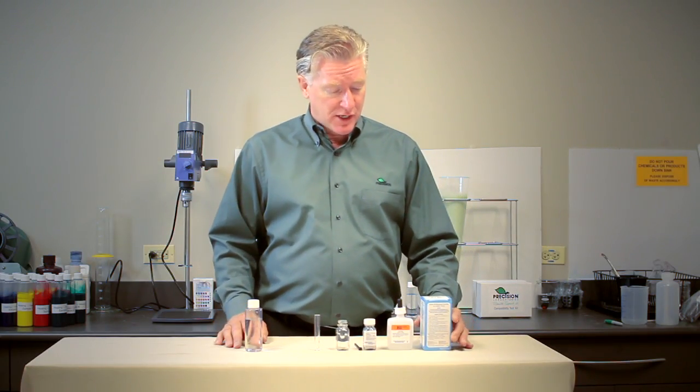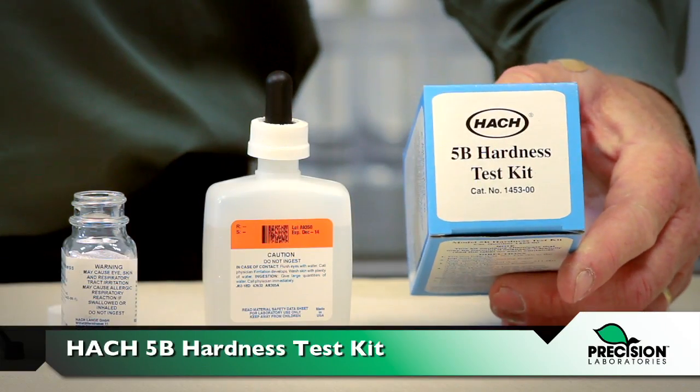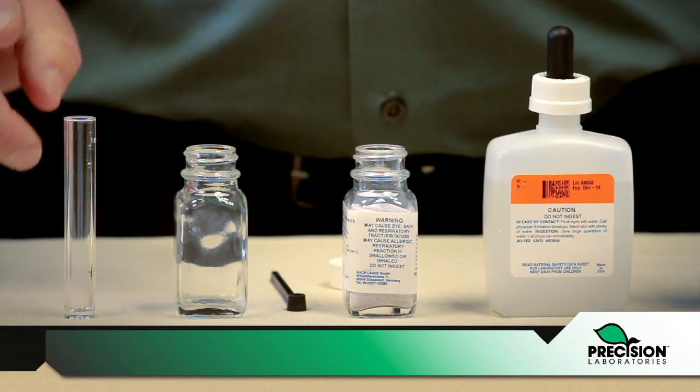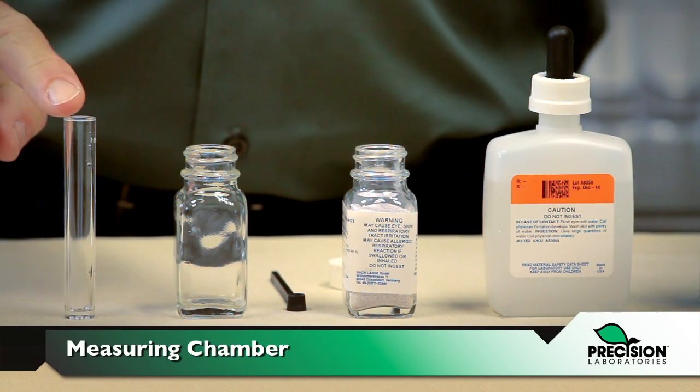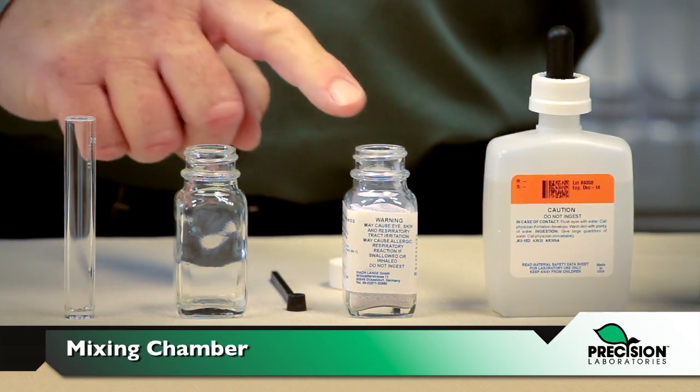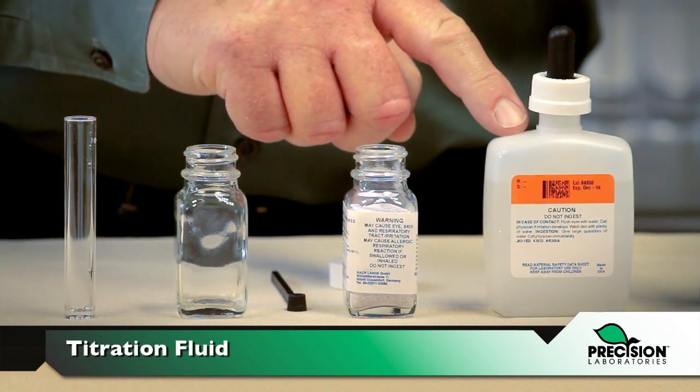A simple way to do a water hardness test is by using a Hach 5B water hardness test kit. It consists of a measuring chamber, a mixing chamber, a reagent, and a titration fluid.